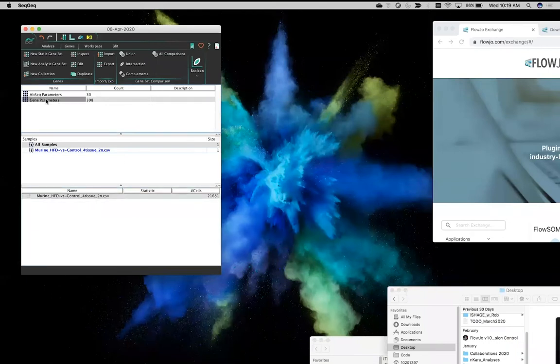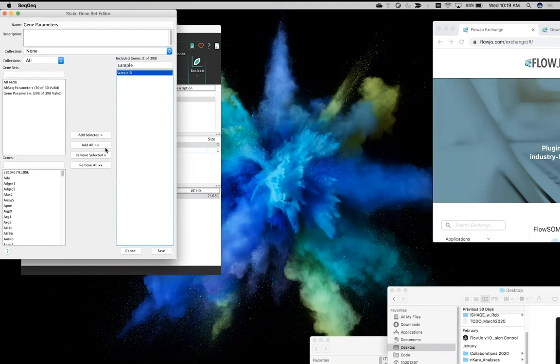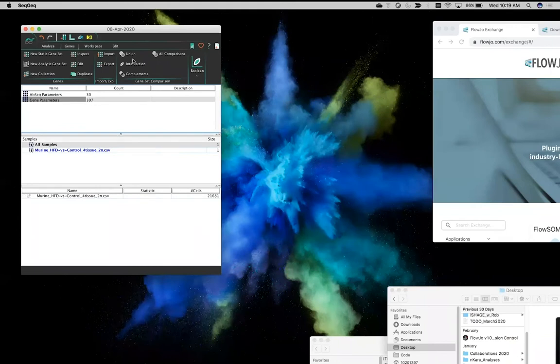I think I may have actually included one extra here. There is also a sample ID, which distinguishes the different samples in my file. Make sure to remove that. And I'm reminding myself of that as I begin to think about the next step, which is normalization.